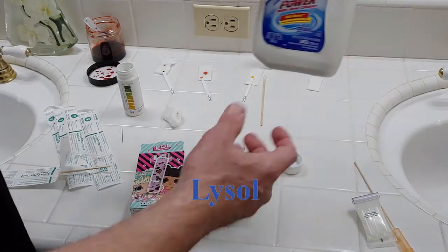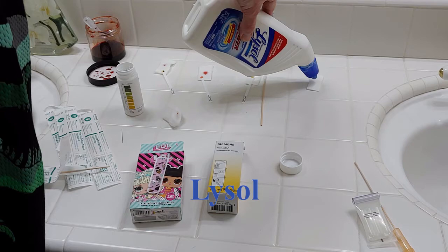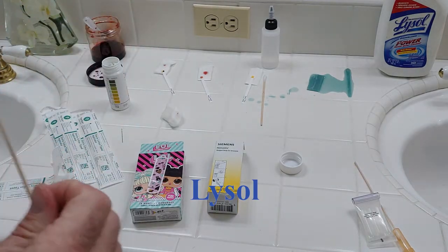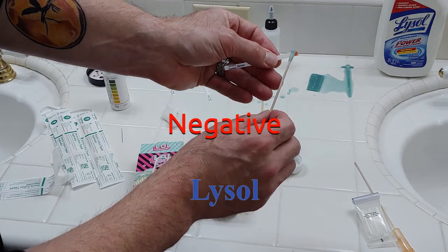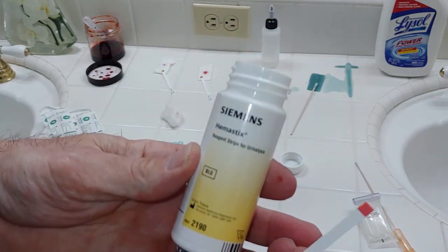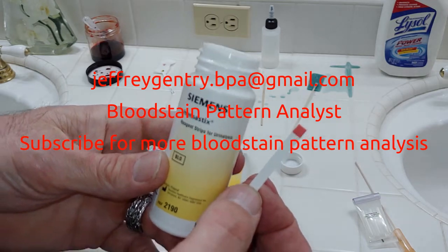The last one should be pretty fun — Lysol. If you have blood out and about, somebody might use Lysol to clean it up, and you'd want to test if that surface has blood or just cleaning product. So I'm going to get some on my swab — and again, no reaction. Even the Lysol compound is not going to test presumptive positive for blood. This is a demonstration of Hemostyx and how it can be used for presumptive blood testing at a scene. I'll show you in just a minute how it can be used to detect blood on a dry surface or dried blood stain.